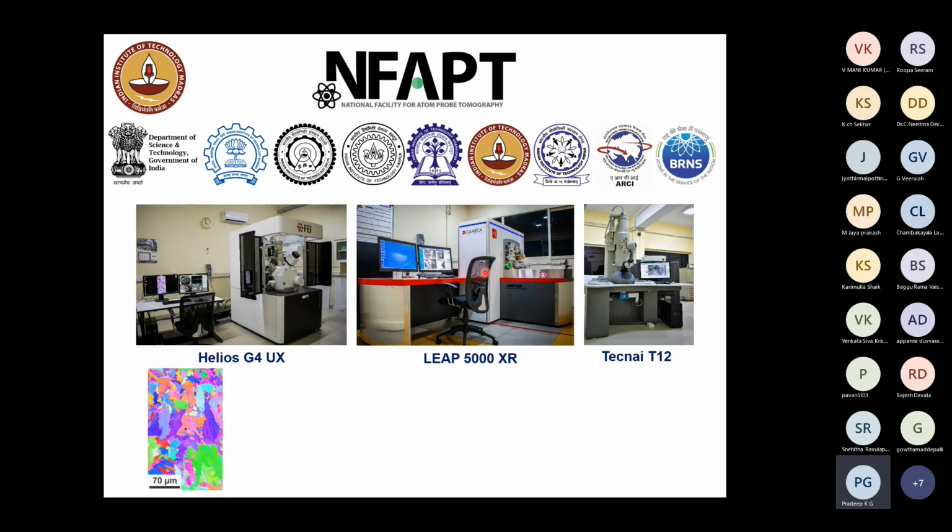Okay, and as you know, if you do a normal scanning electron microscope based imaging of materials together with orientation mapping, you will be able to see this microstructure with orientation details and possibly the phase analysis that you can do. But sorry, if you want to have localized information, that means in a certain region, for example, this interface, if I want to know the exact chemical composition of the interface, or if I want to know the crystallographic details at the interface, then for the crystallographic details, we can go into the transmission electron microscope by preparing a sample out of this region of interest.